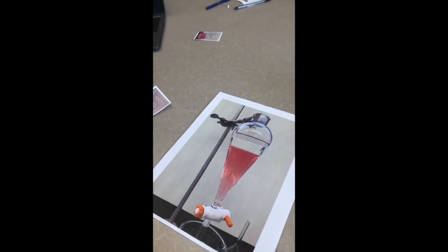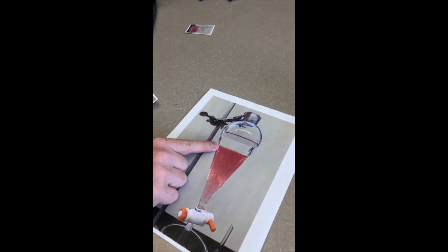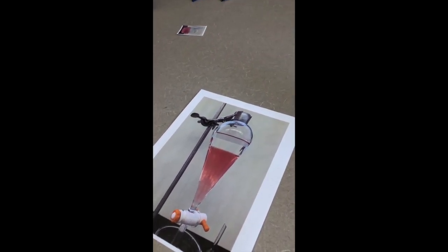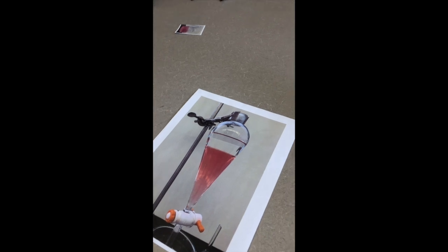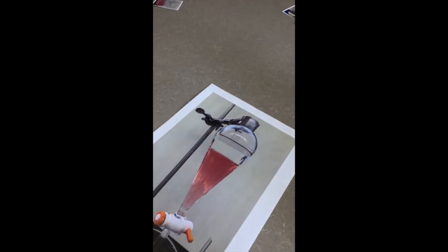So as we drain the organic layer, we have the interface we need to worry about. And the interface is a small liquid portion that actually consists of where the 2 liquid phases meet. So the interface is actually going to go out with the organic layer. So we'll drain that out with the organic layer. And it will be used over and over.